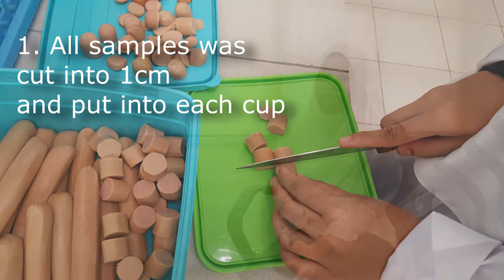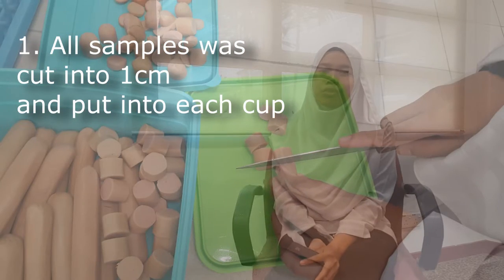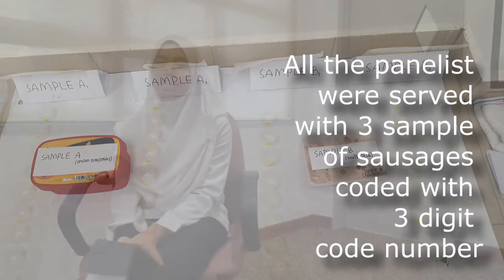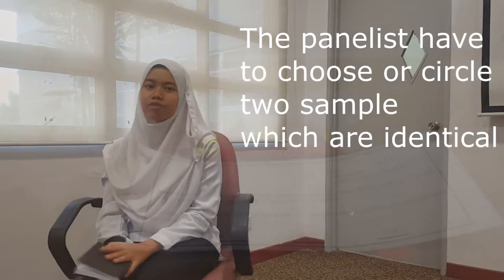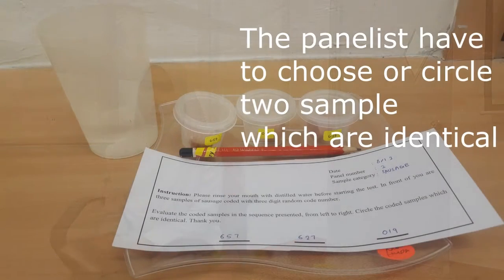The procedure begins with all the sausage samples being cut into 1 cm pieces and put into each cup. Then all the panelists were served with 3 samples of sausages labelled with 3-digit numbers. Panelists have to choose the 2 samples which are identical.